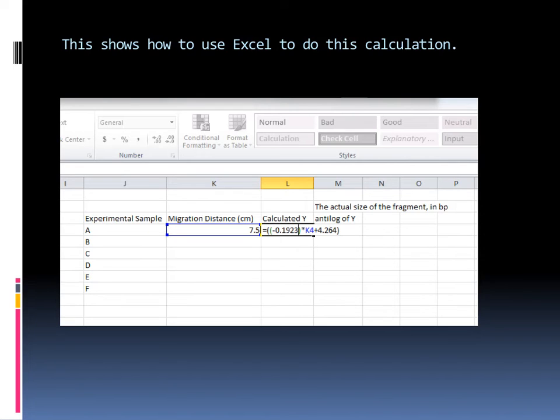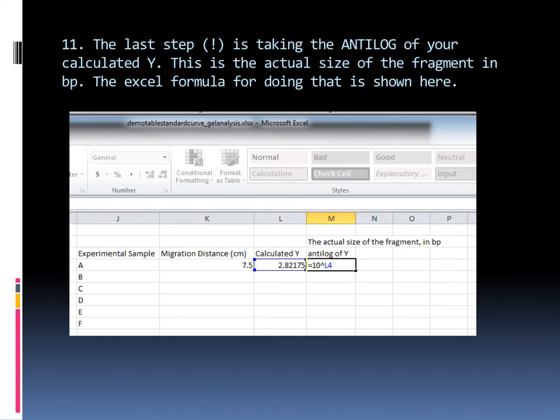Again, using Excel, I create a column where I put the experimental sample label. Here just A through F. I have a migration distance column in centimeters. I enter my 7.5 that I just measured into that. So I get this by measuring off the piece of paper. And then I'm going to actually calculate the Y value. And I'm going to use Excel to do that. Here I've got equals and I've input the equation. K4 is telling it to refer to this distance. You can do this on your scientific calculator, but it's easier and quicker to learn how to do these things in Excel. When we return that, we will get the log to the base 10 size of the fragment, which is still not the actual size of the fragment. So we returned and we got this value here.